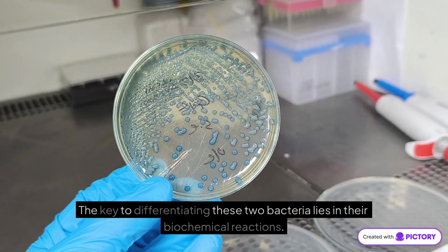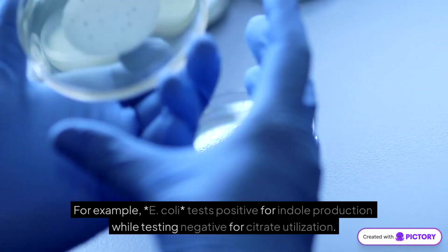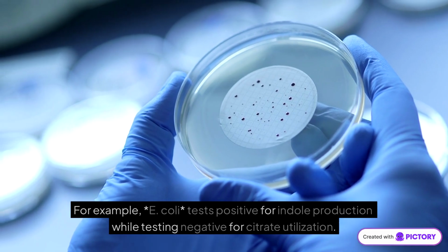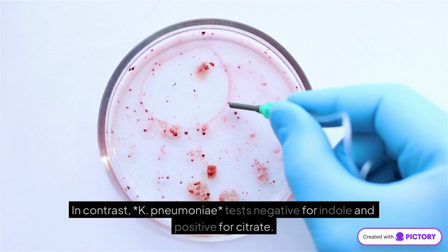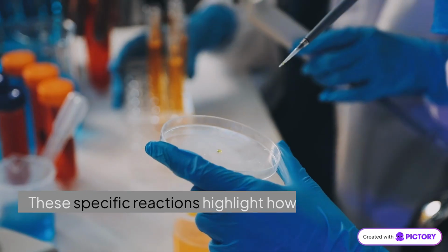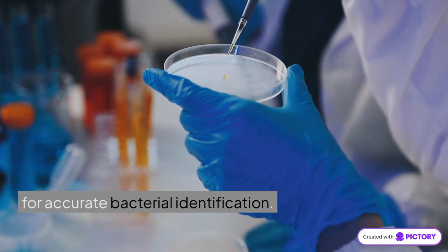The key to differentiating these two bacteria lies in their biochemical reactions. For example, E. coli tests positive for indole production while testing negative for citrate utilization. In contrast, K. pneumoniae tests negative for indole and positive for citrate. These specific reactions highlight how biochemical tests serve as a powerful tool for accurate bacterial identification.